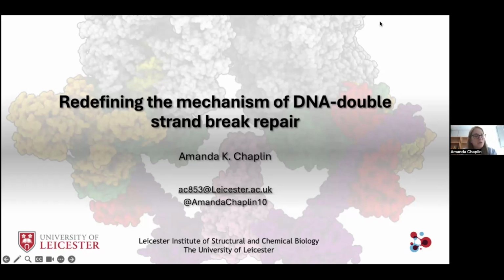I'm a lecturer at the University of Leicester. I've been here now almost 3 years. I'll be telling you today a bit about some of the research that my group is doing, a little bit about each of the different research areas that we're looking into. So if anybody has any interests or any questions, please do get in touch afterwards, or obviously ask questions at the end of this talk. So my group largely uses cryo-EM and structural biology to look at DNA repair mechanisms and other biological processes.